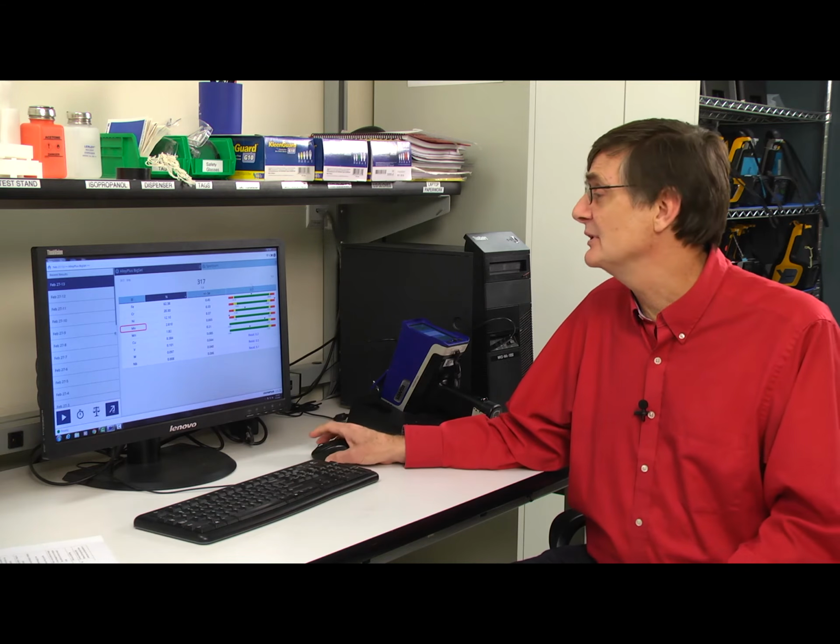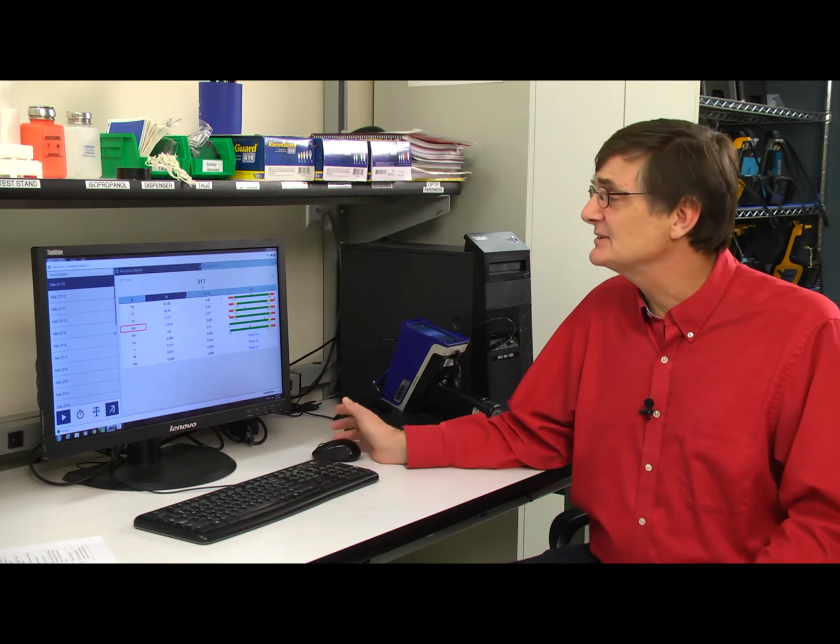The PC software will work with both a touchscreen tablet as well as the traditional mouse and keyboard that I'm showing you today. So this is the basic idea of the navigator, how you control the PC software, and control the VANTA from the PC software.